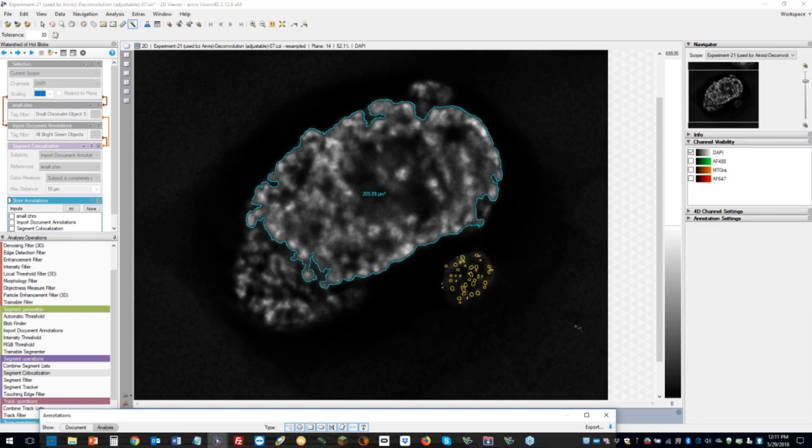So I would say we don't have something like a quality control operation, but we could build a pipeline that performs some series of operations, grabs some objects, and reports to you properties of those objects that you could use for quality control.